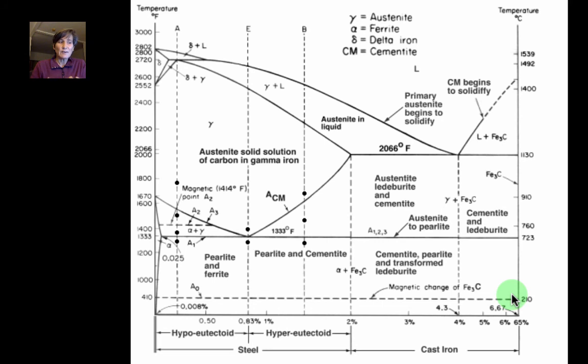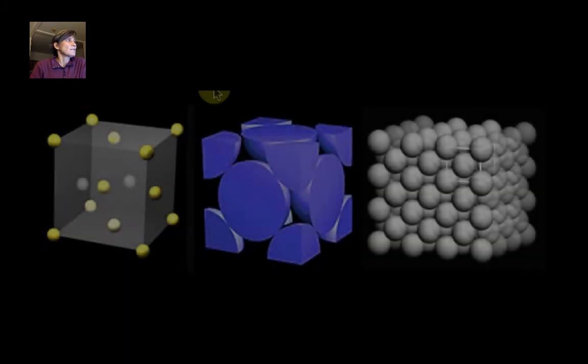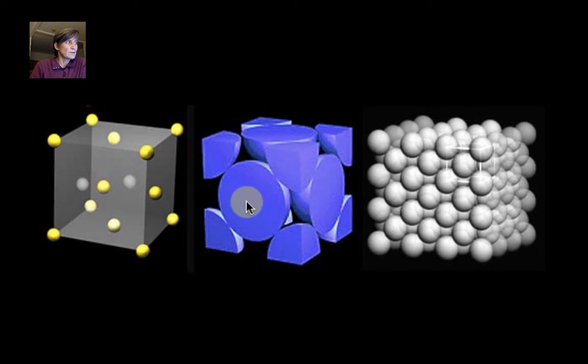And so the XRF only gives you information at the level of the core electron transitions, regardless of what the crystal structure is.